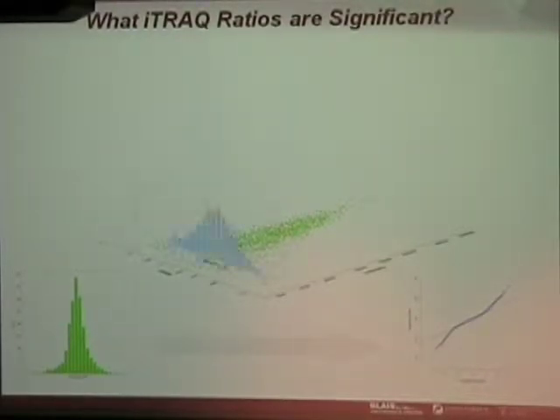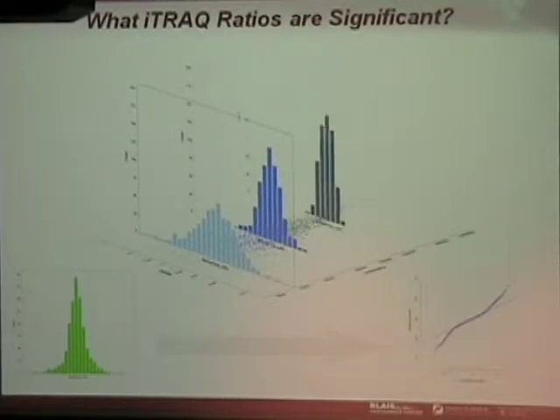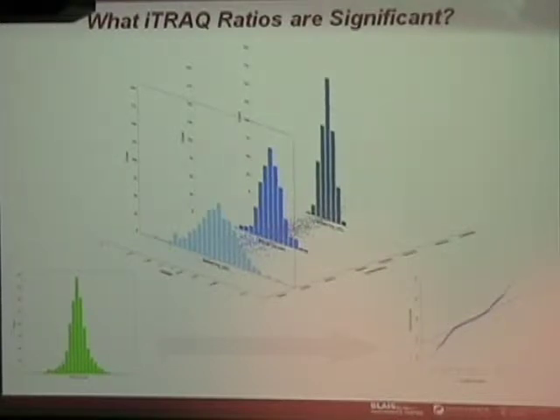And if you look at specific intensity ranges and look only in those, then the log ratios look normalish. And so what we did, and again, the details are in the publication, which will be attached with what we post.